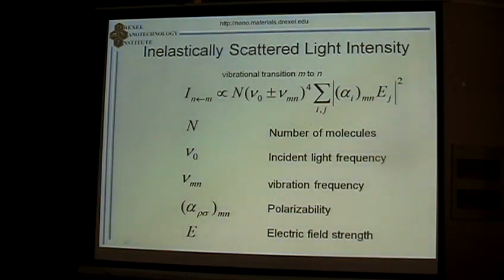So, if you want to have a Raman signal from a single 1 nanometer nanotube, you need to get the right frequency, you need to bring it in resonance. This is your only chance to get sufficient intensity from a single tube here.